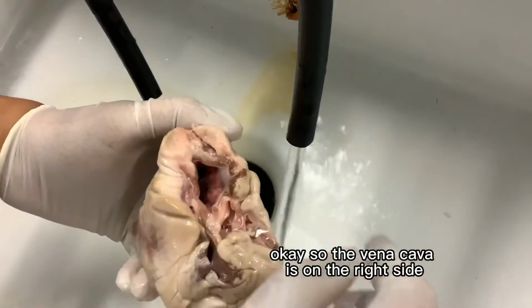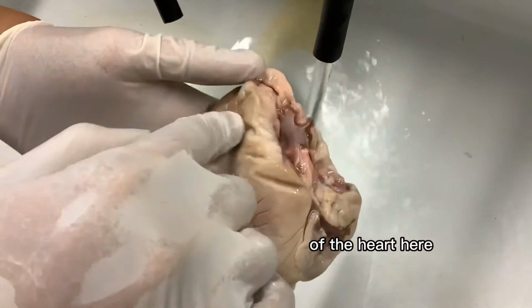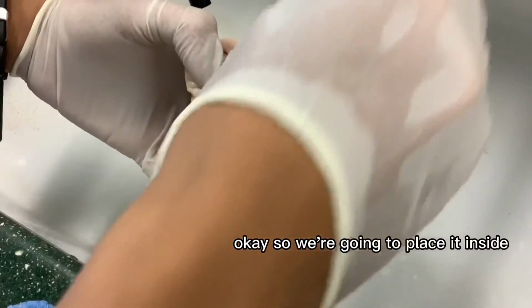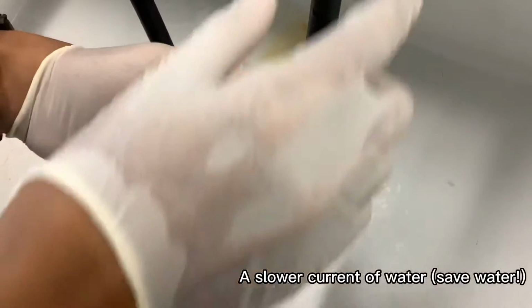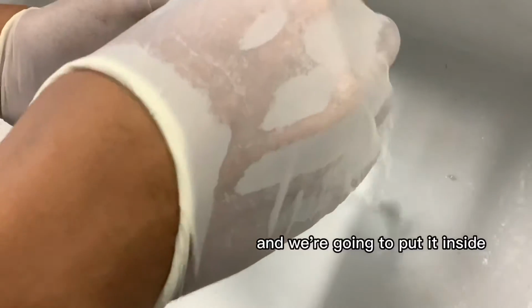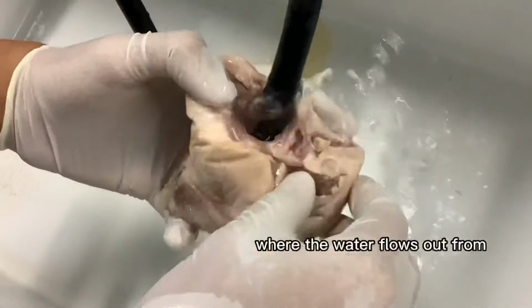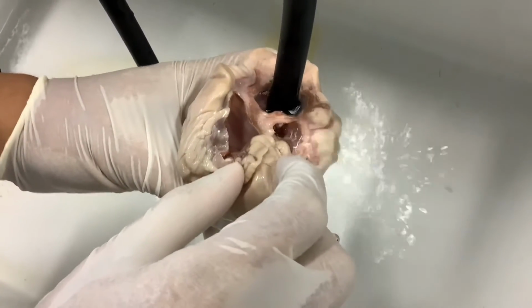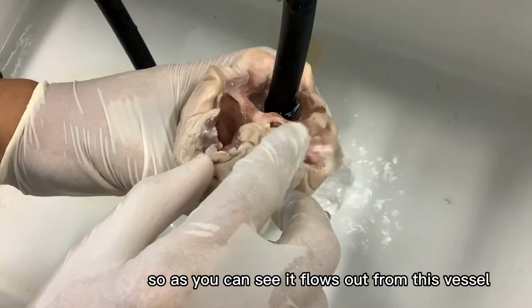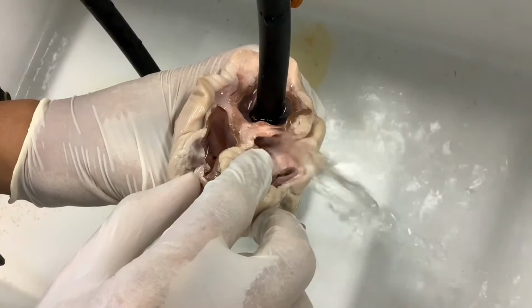Okay, so the vena cava is on the right side of the heart over here. So we're going to place it inside. I think we need a slow current of water, okay, and we're going to put it inside. And then we're going to observe where the water flows out from, okay. So, as you can see, it flows out from this vessel. So, what do you think is the name of this vessel?